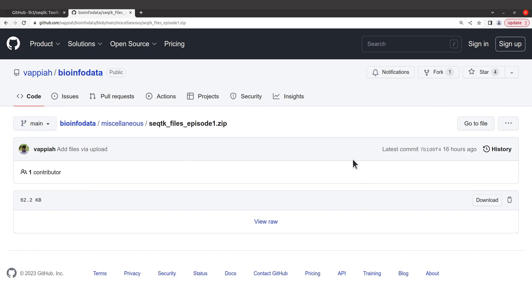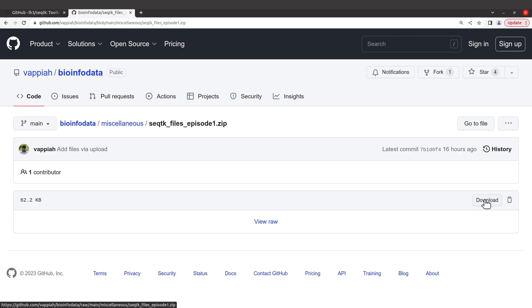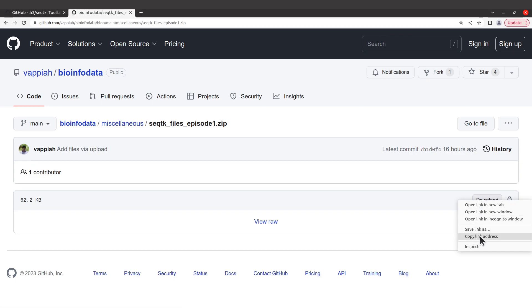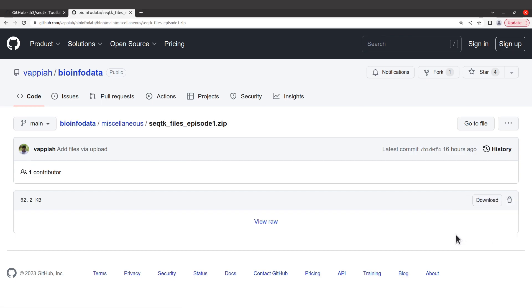You'll be sent to this page. Come to this side and click on the download button — this will download the file. Alternatively, you can get a download link, which is what I'll do. I'll right-click and then go to "Copy link address", then move to the terminal.